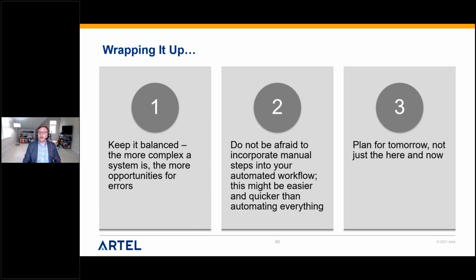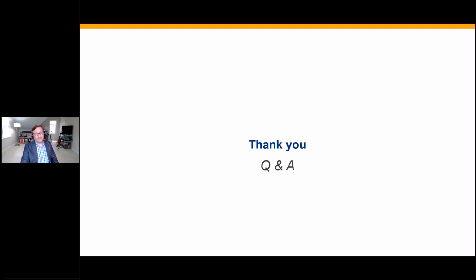And then finally, let's plan for tomorrow. Don't just think about the here and now. Think ahead a year or 2 years, and that'll help guide you on selecting the appropriate automated liquid handler.